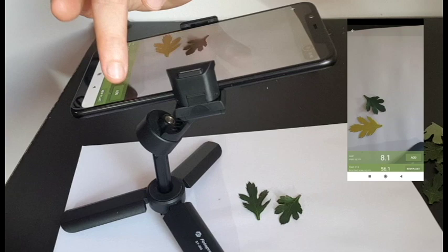And finally, we have the result: 70.1. I hope you enjoyed today's measurement of plant leaf area with the PTL mobile application. See you again — I will try to provide you more insights about PTL and how to work with it more effectively in your plant research. Thank you.